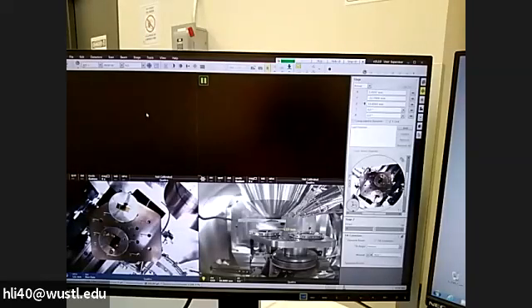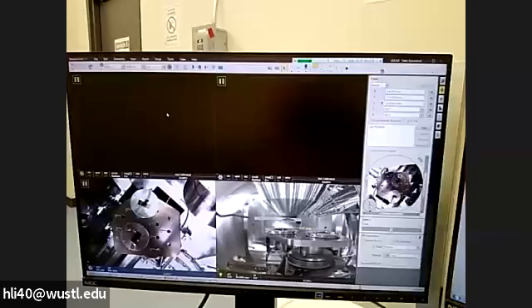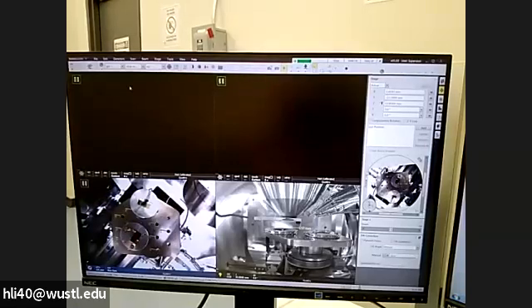All right, so now we need to operate the software. I understand it's not very clear on the screen. So for the SEM operation, all these buttons you can play a little bit. So we have magnification, accelerator voltage.